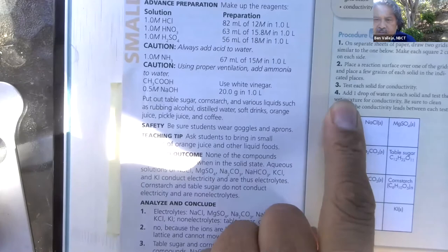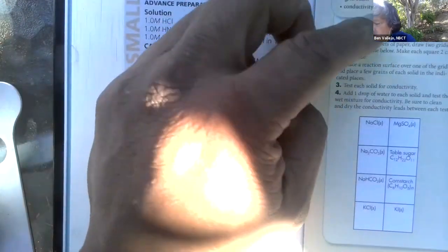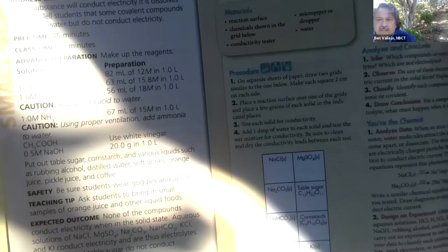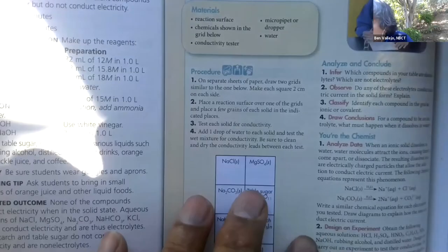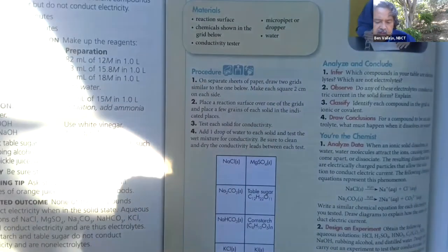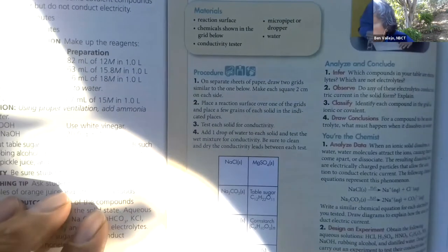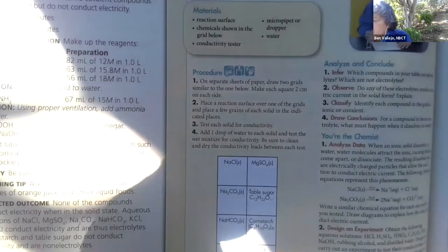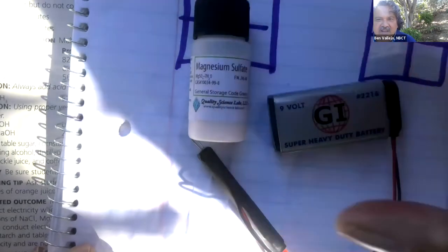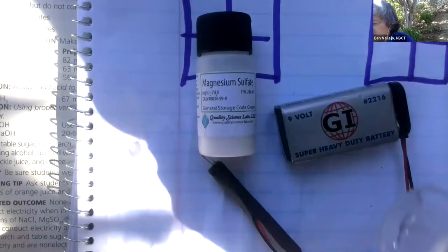And then, oh gosh, that's a procedure. That's all you need. So now you have everything you need in order to answer these questions. So to finish up, I'll have you write up a lab report, but just remember, it's like always, no tricks or anything. You need a cover sheet with some kind of photo. You could do a photo of a lab setup or something like that. If you did it with me, do you want to take a screenshot of something like the electrodes and the magnesium sulfate or something like that? You know, you could work something.